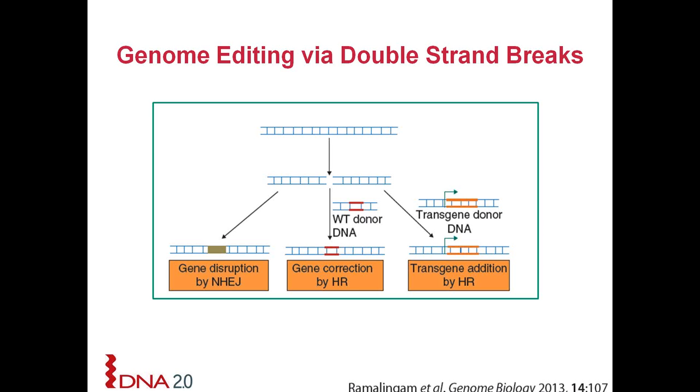So we usually end up screening for single colonies, and then we'll check for whether the mutation is present or not, and we can tell which one it was. So we would simply isolate single colonies and then look for the indels in those single colonies. And if one has it, we have our guy and we keep that then as a positive. Excellent. This one's an interesting one, and we'll see what we can do with it.